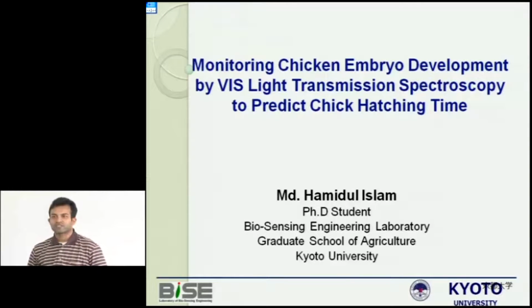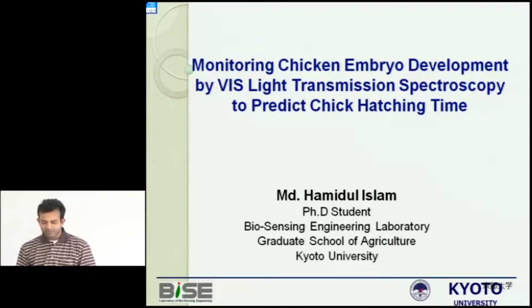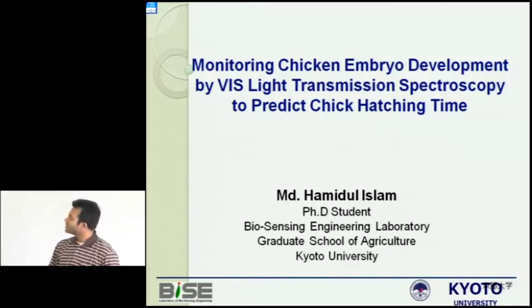My presentation topic today is monitoring chicken embryo development by visible light transmission spectroscopy to predict chick hatching time.